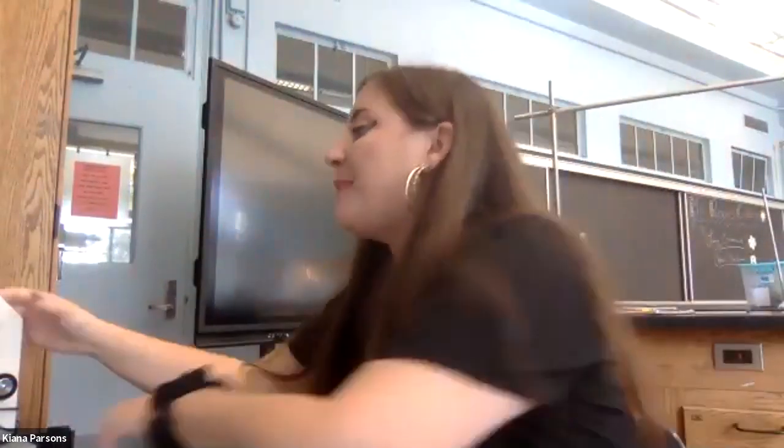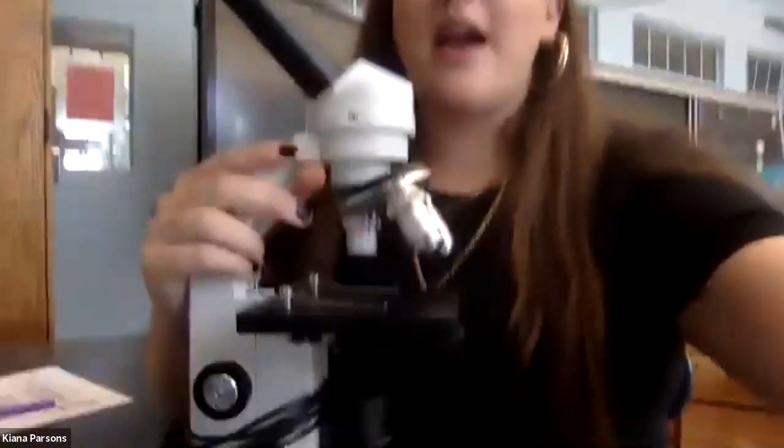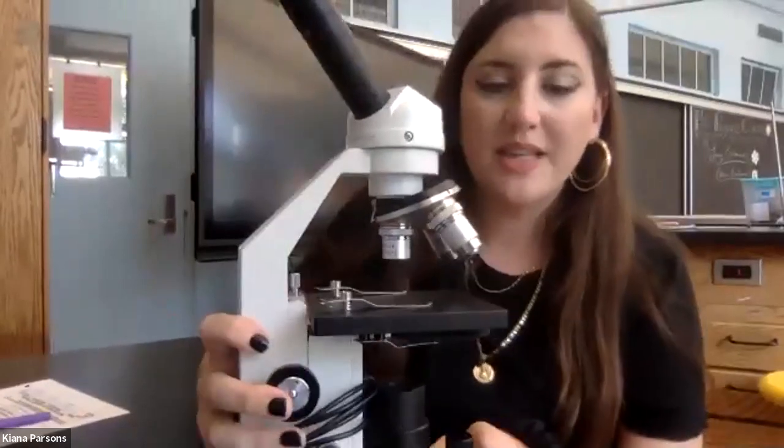I am your teacher, Ms. Parsons, and today we're going to be looking at Unit 1, Day 6, our microscope pre-lab. And because, unlike you guys, I am here in the school building, I have a microscope that I can show you guys. So here's my show and tell piece.